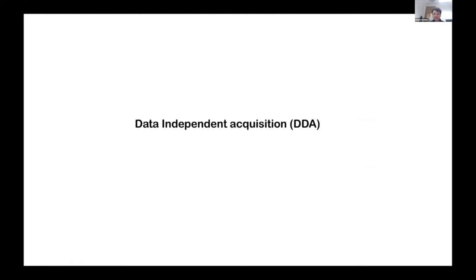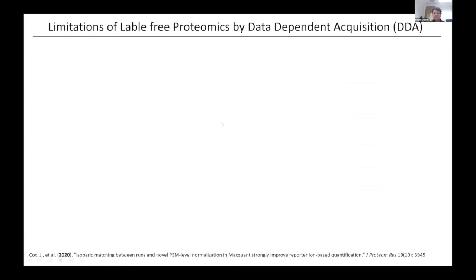So this is an error here. I apologize. I wanted to move on to data-independent acquisition strategies now, and just to maybe highlight a few of the limitations of the approach that we've just looked at.